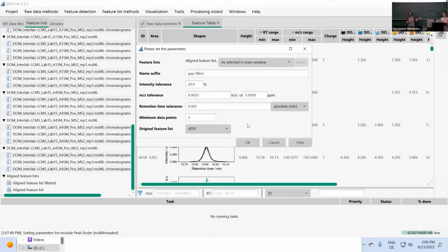So I always say we just do an informed secondary feature finding in 1 step. We fill in the gaps, and if there's intensity, and the mass spectrometer is very specific, right, if it detects intensity in this region, I want to see it in my statistical analysis.